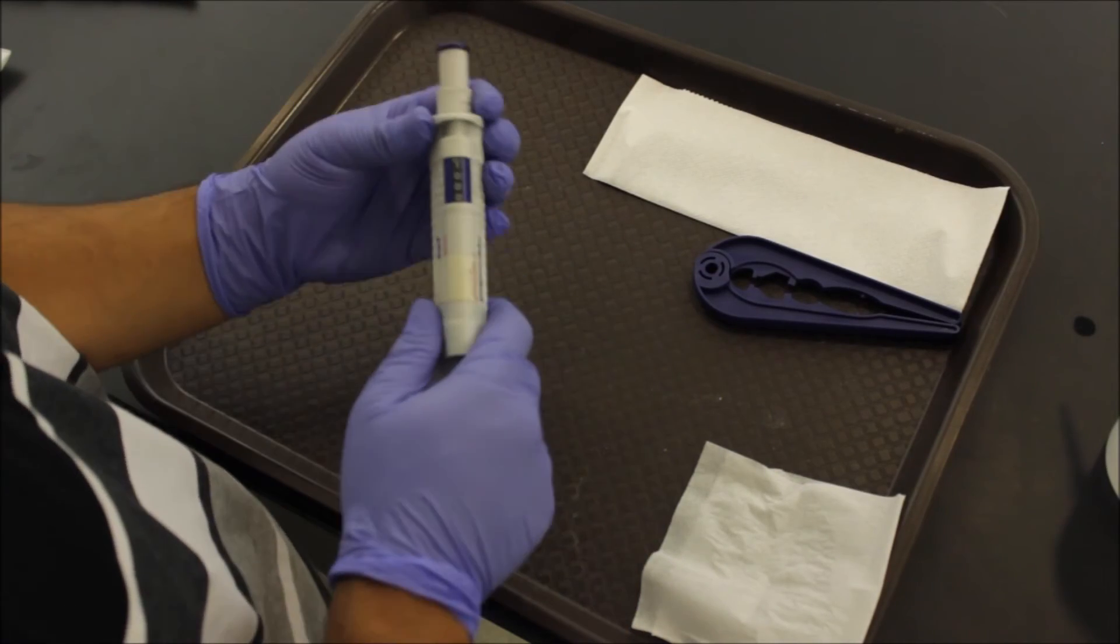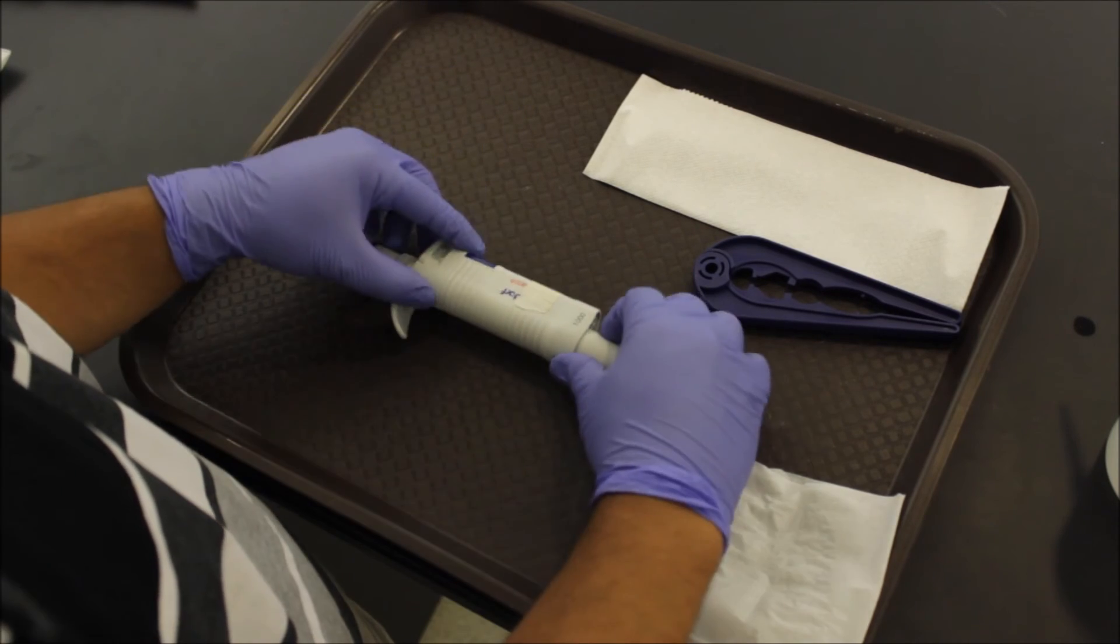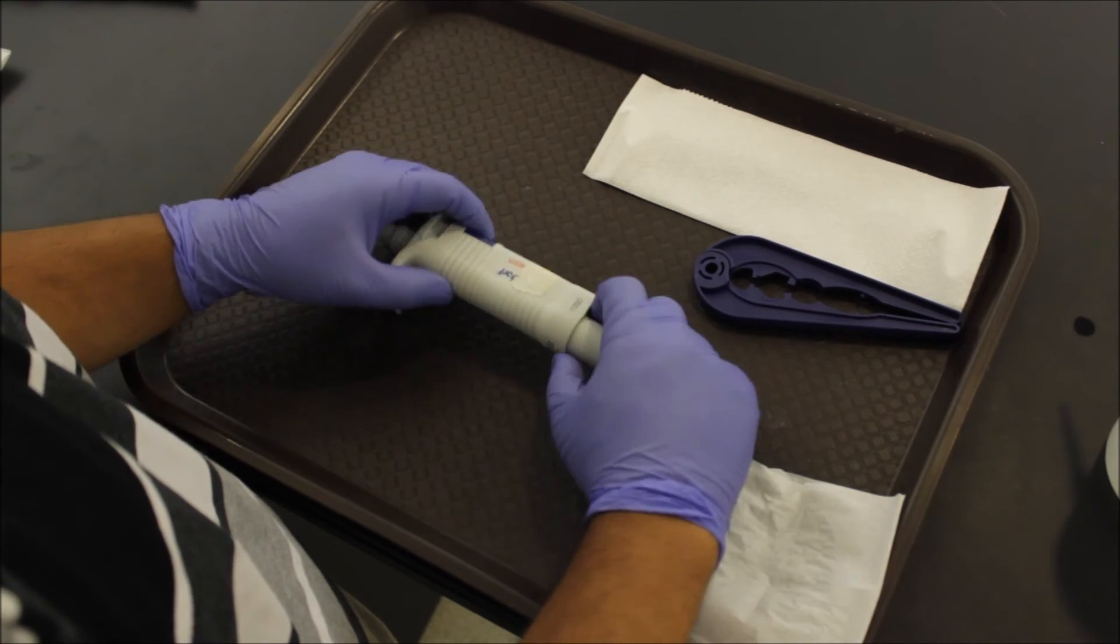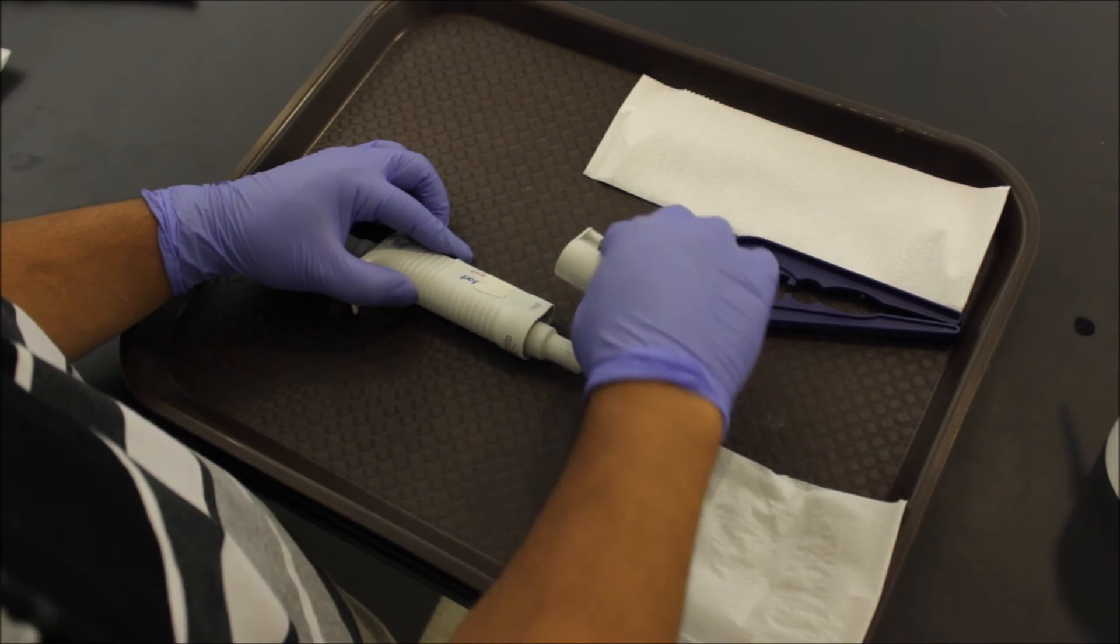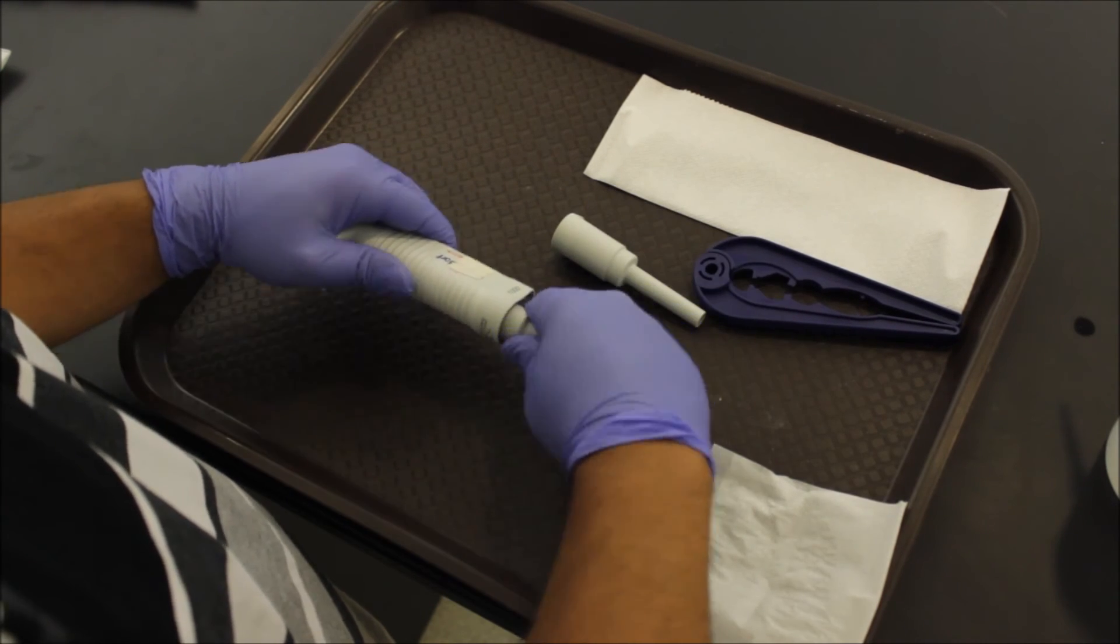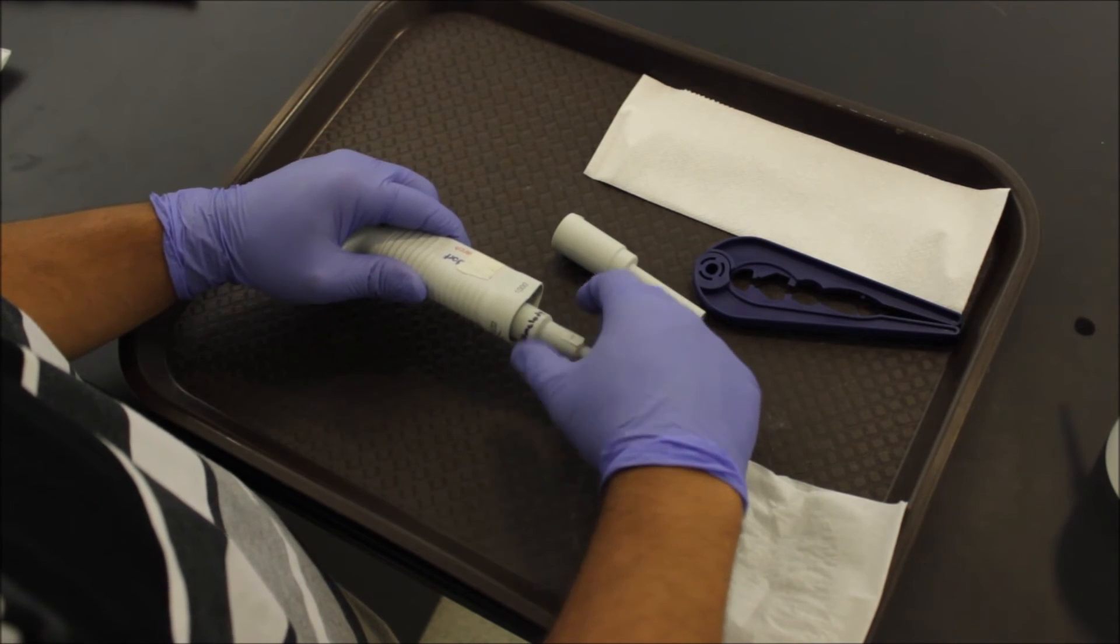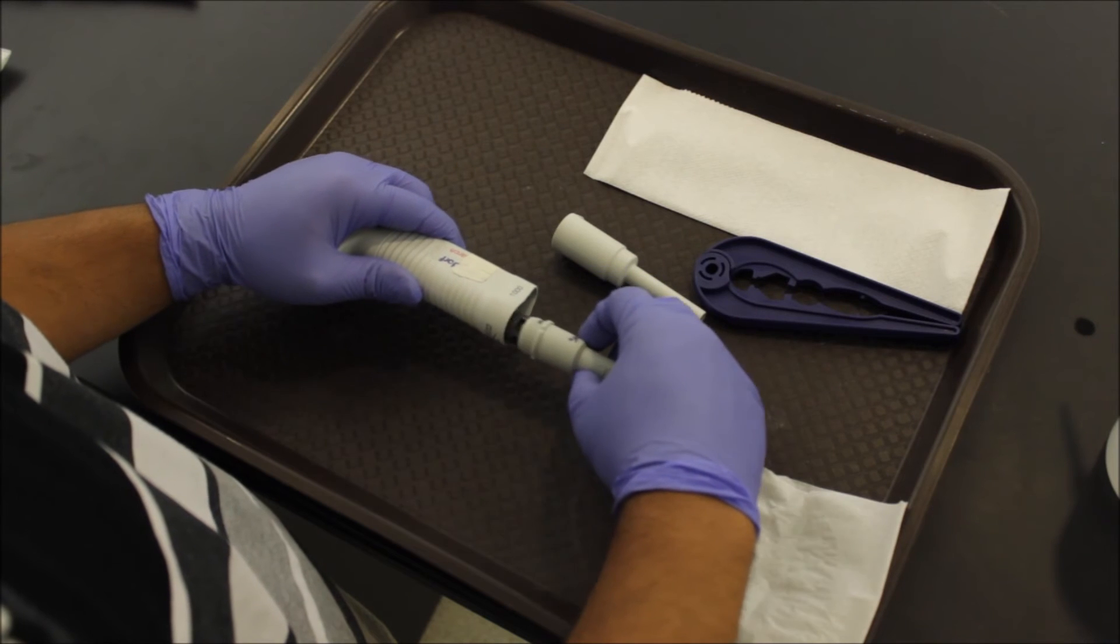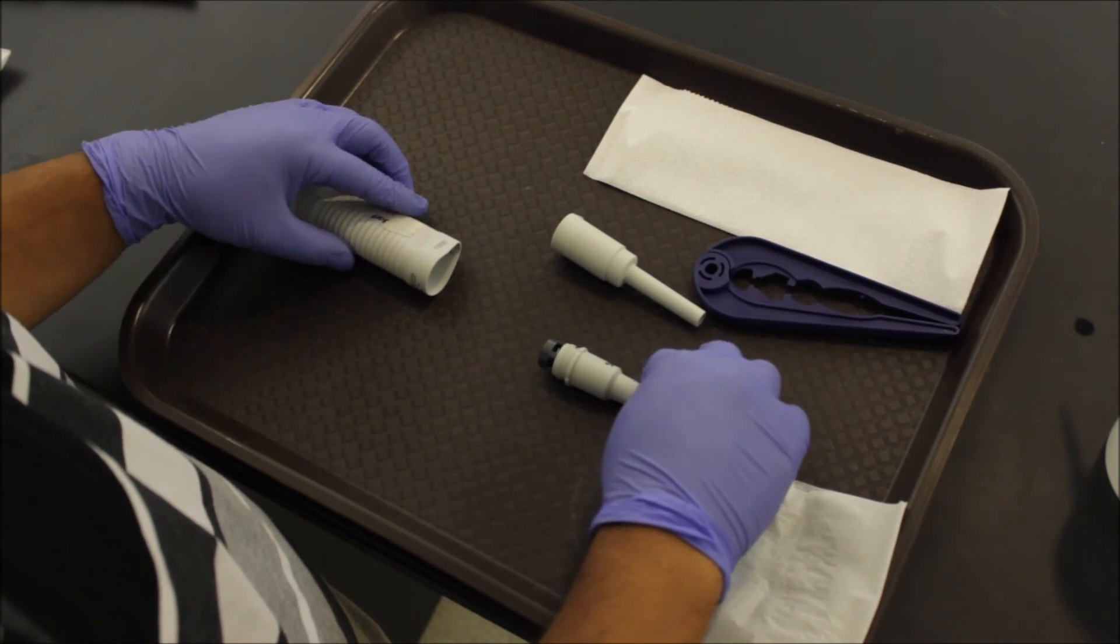All right, so here we got the Eppendorf research pipette. Slightly different. Once again, make sure your volume is set to max, which is 1,000. So we're going to slide off this outer shaft. Check that for any debris. Grab this inner core and just give that a hard twist. Slowly screw that out. Check the actual pipette for any debris.